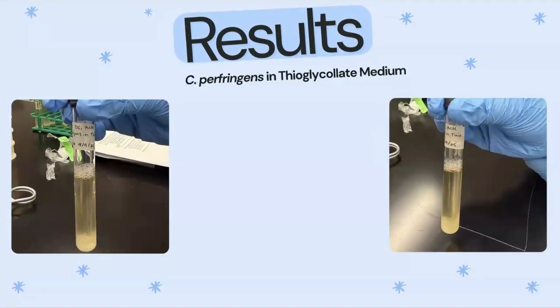The C. perfringens in this type of medium also seemed to have a cloudy appearance at the bottom of the test tube, indicating that there was growth.